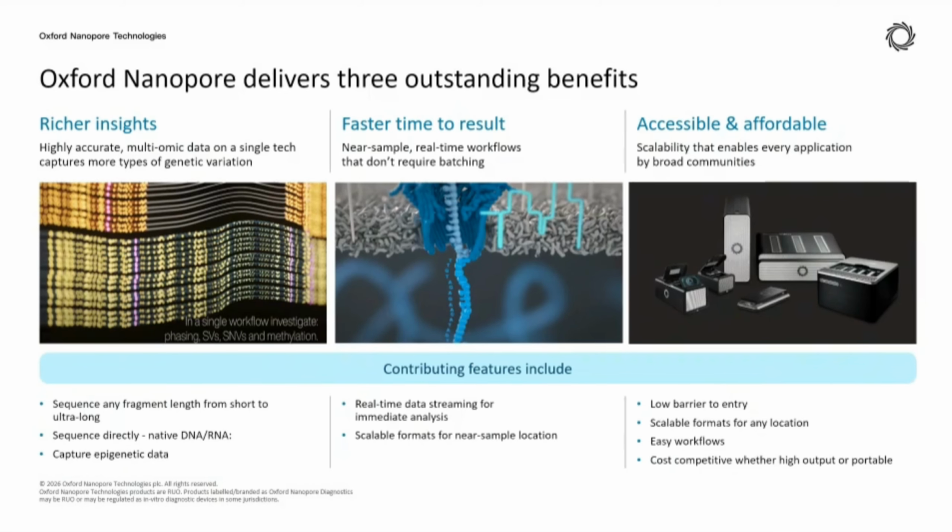Also, at the moment, I think the Oxford Nanopore sequencing solutions are one of the most affordable ones, and they are easy to get for most users. It comes in different scales, depending on the requirements or the demands. Users can choose whichever solution works best for them.